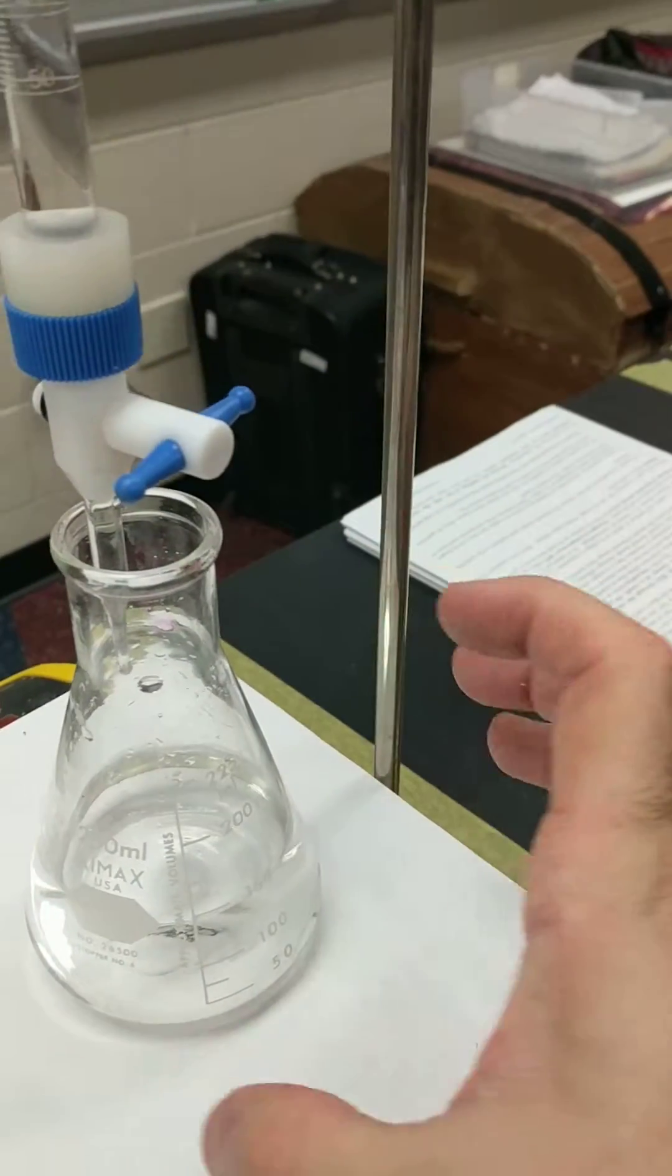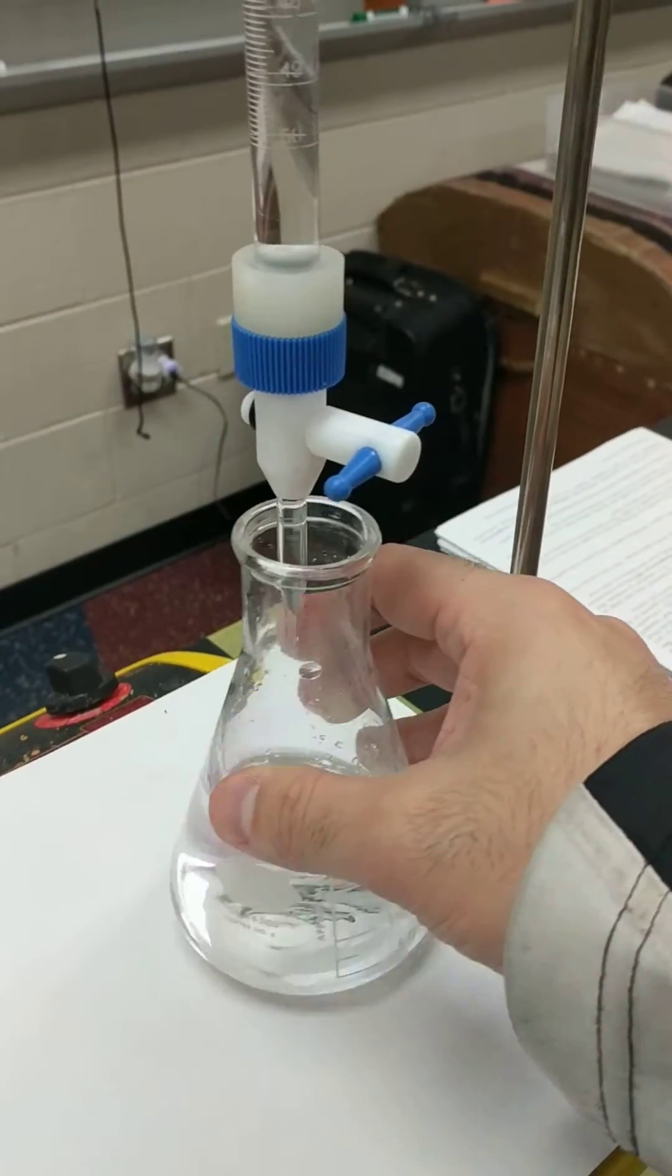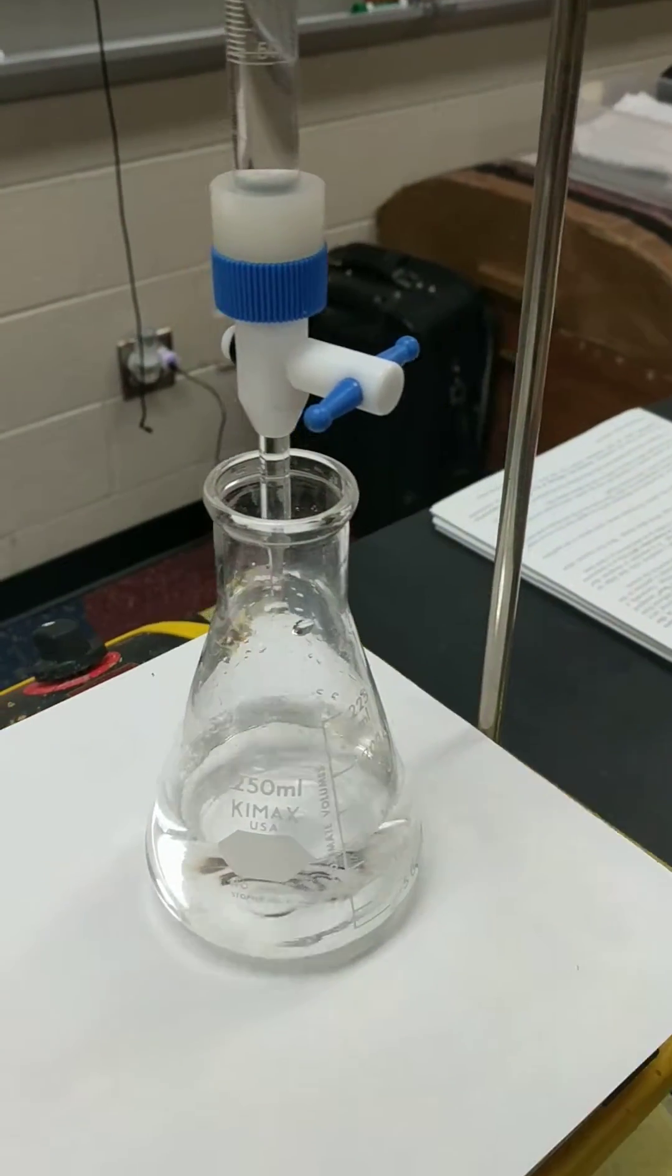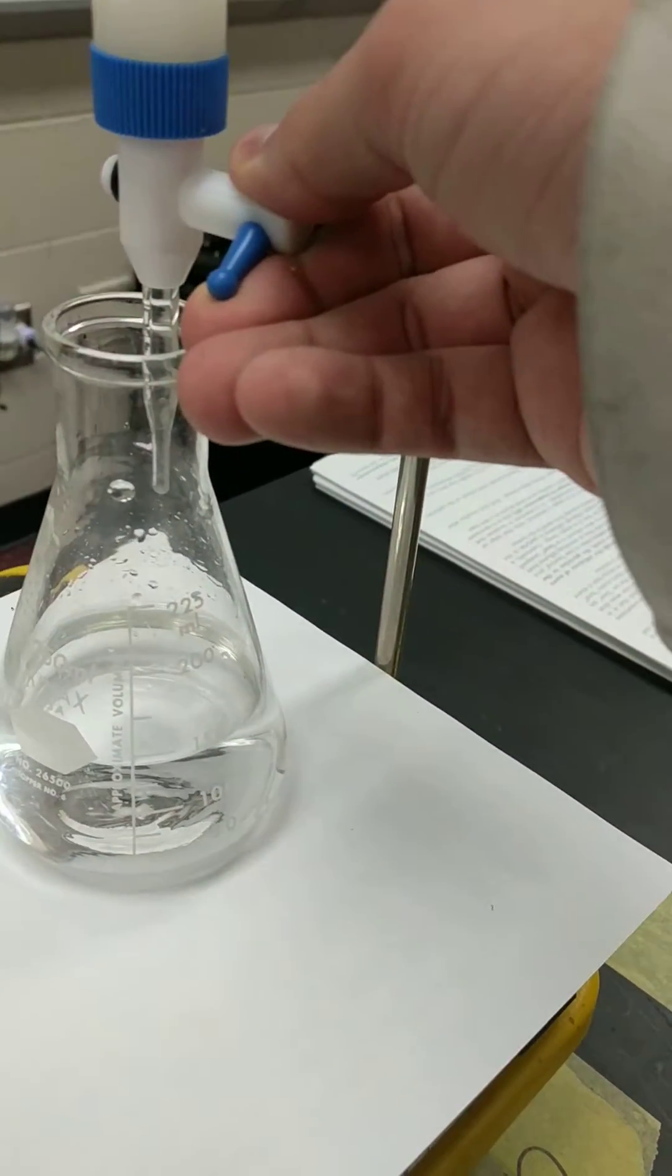So when the pink color kind of goes around like the entire flask, like I just had right now, it's very close to the endpoint, right? It's almost there. Right now it's still colorless. I'm going to add another couple of drops.